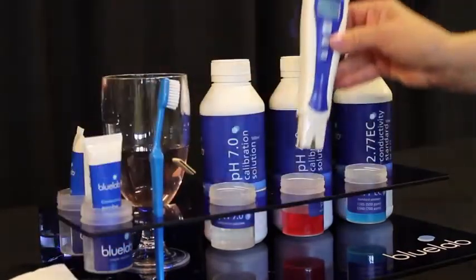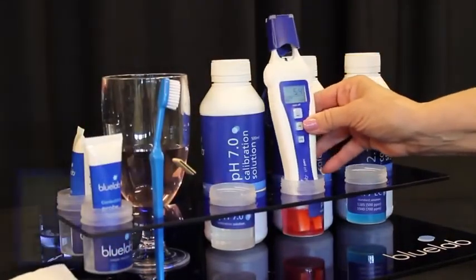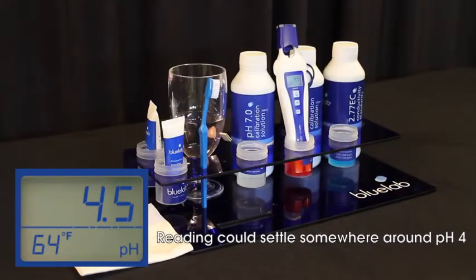Next, place the pH pen in freshly poured Bluelab pH 4.0 calibration solution. Wait for the reading to stabilize — at least a minute or two.